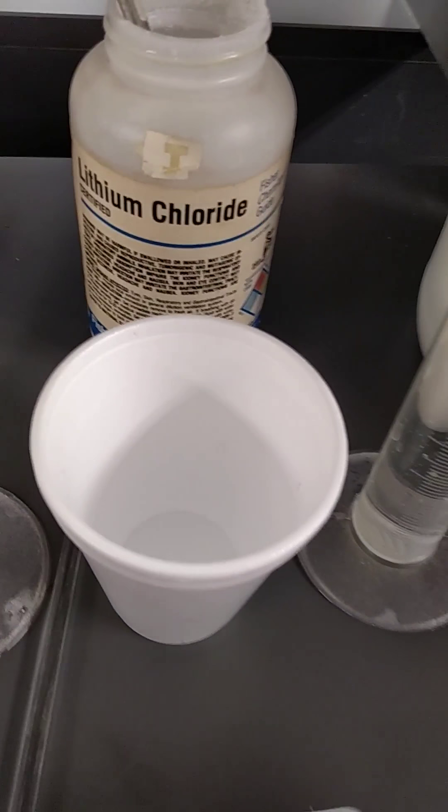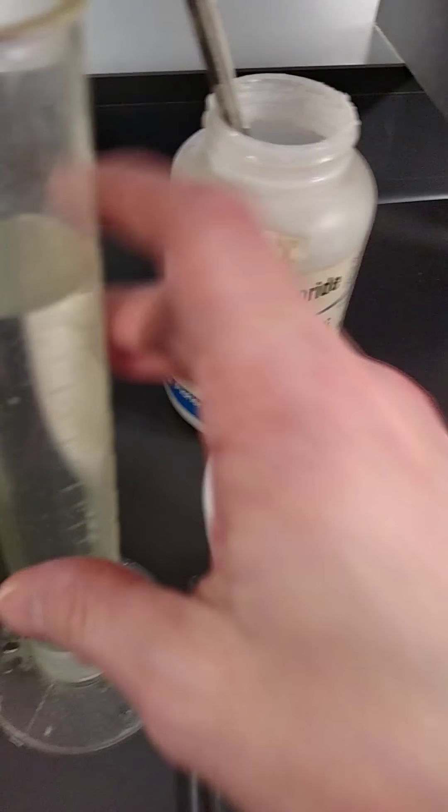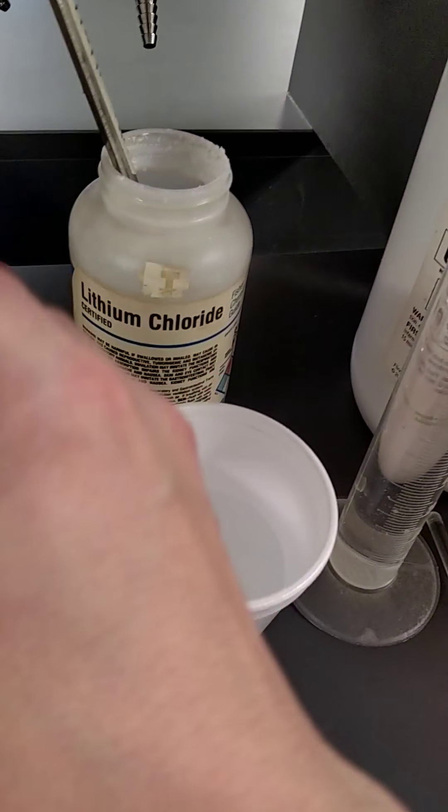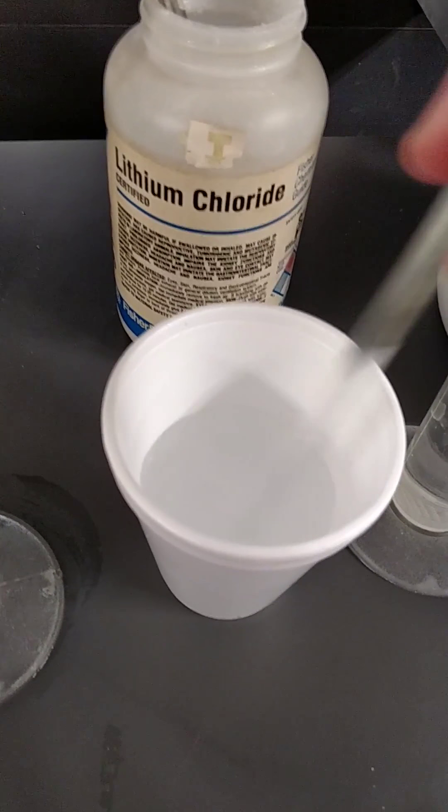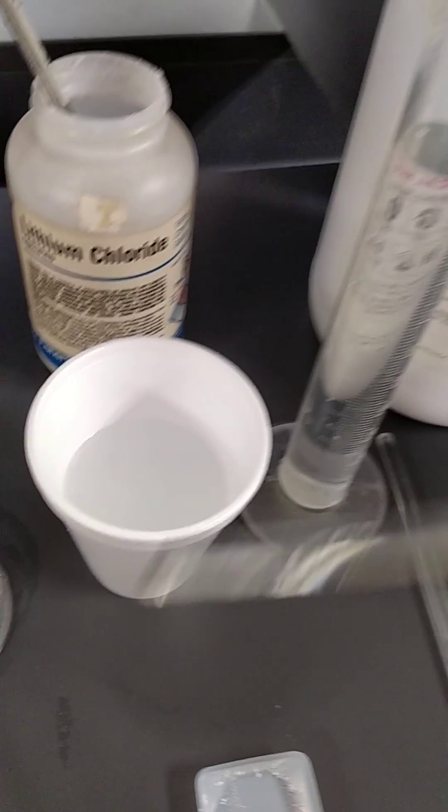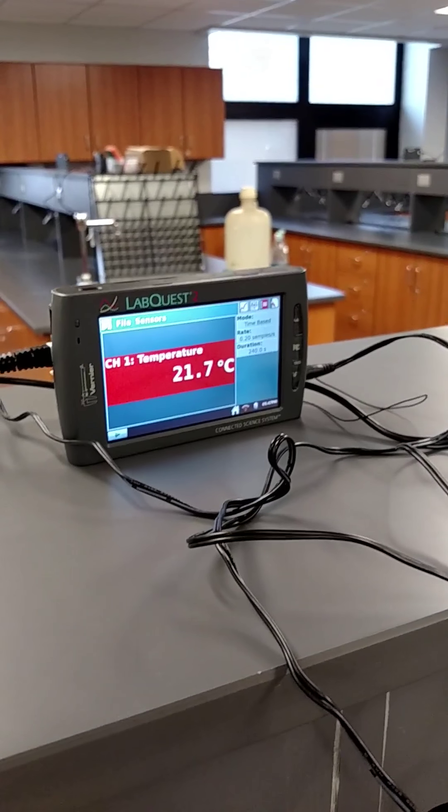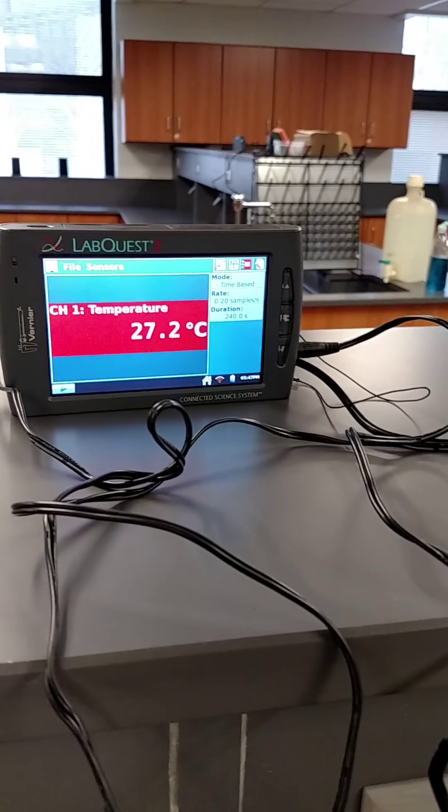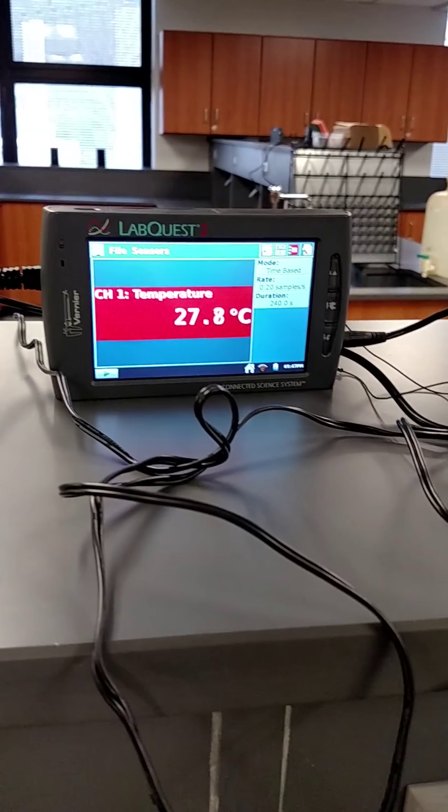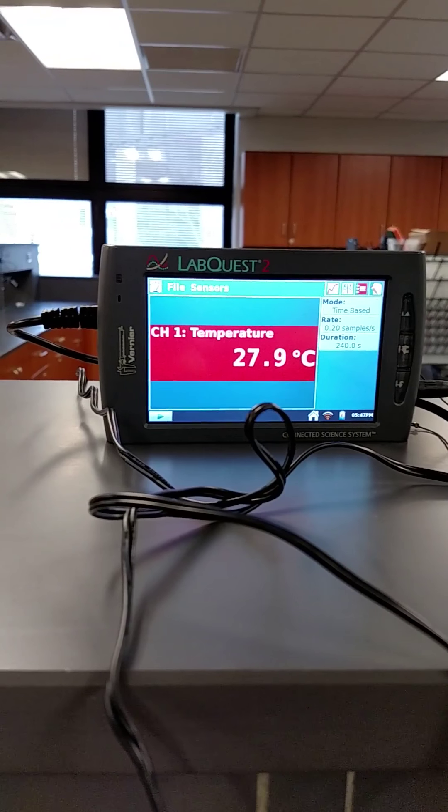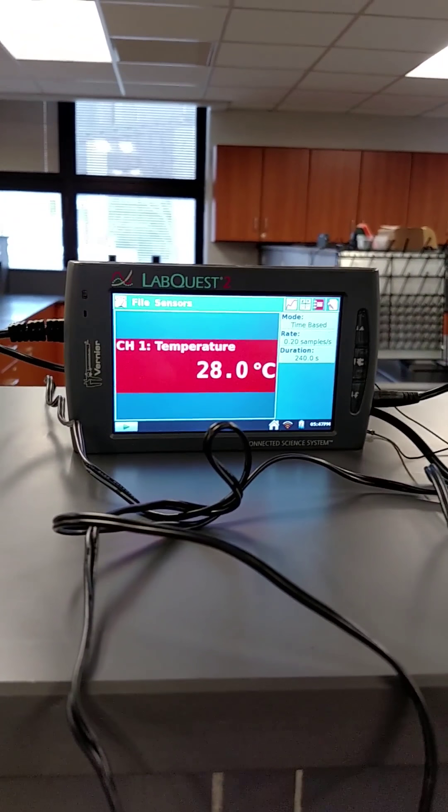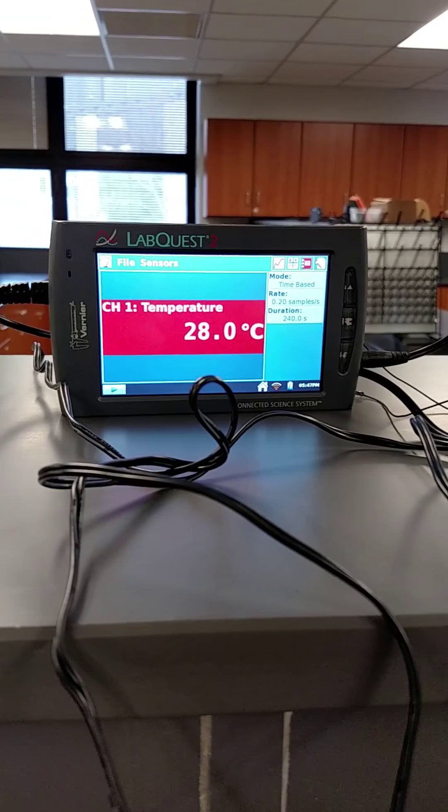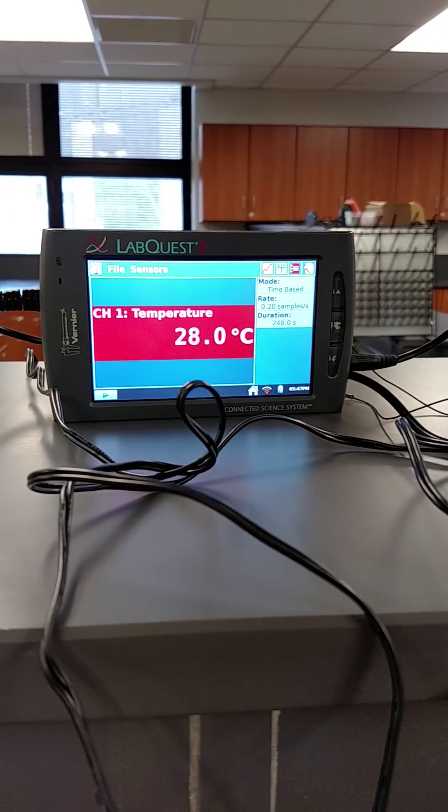Lithium chloride. There's my five grams, 100 milliliters of water. I'll give it a stir. And now we'll add the temperature probe, 21.6 initial temperature. Now you can see that's a pretty big change.